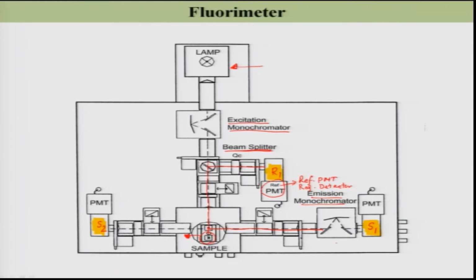So, now when you are going to measure, it is also clear at this point that to get the corrected emission spectra, you already have generated the correction file, right. The correction file is the S lambda file, as I just explained. So, you already have this S lambda file for correction.